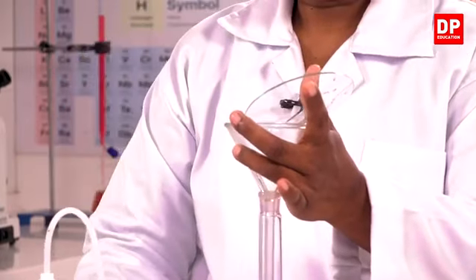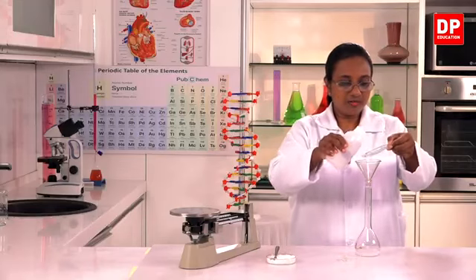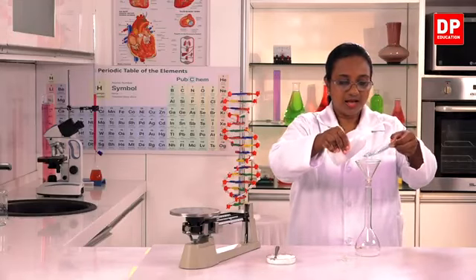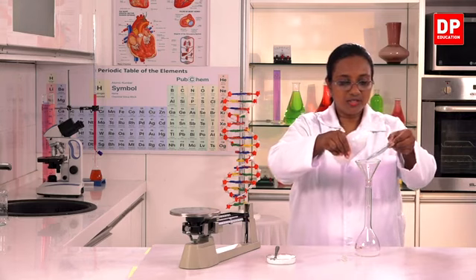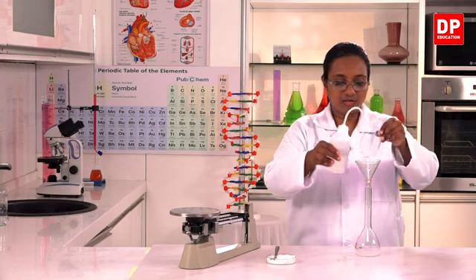So here I have transferred the solute, everything from the watch glass, and I wash it with more water to make sure that all the solute is dissolved here.